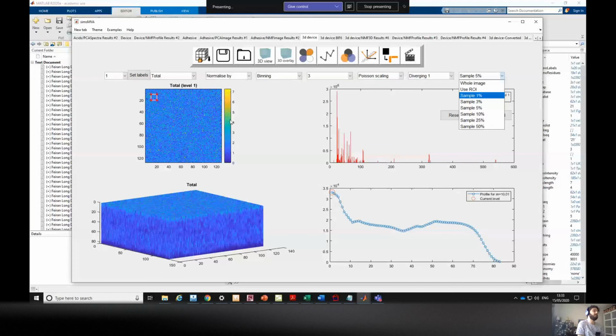First, if you had the memory to load all this and process, it will take forever. It may take, let's say, half an hour to process. Secondly, you will not necessarily have this memory. So if you process just a few of the voxels, you can fit into your computer memory, and then you get the results afterwards.